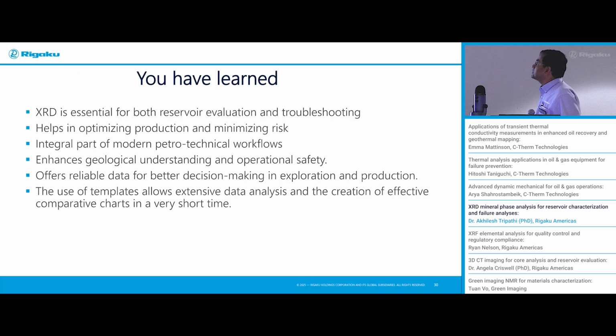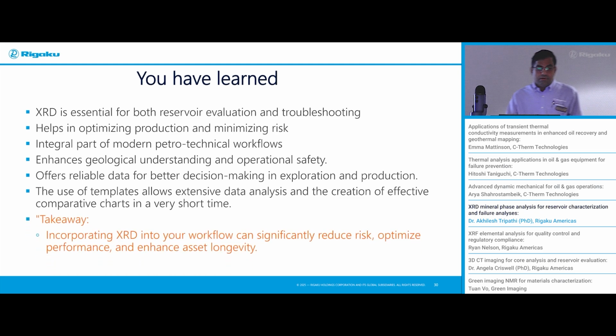So I believe with this presentation, you learned XRD is essential for both reservoir evaluation and troubleshooting, helps in optimizing production and minimizing risks. It could be an integral part of modern petrotechnical workflows. It enhances geological understanding and operational safety, offers reliable data for better decision-making in exploration and production. The use of templates allows extensive data analysis and the creation of effective comparative charts in a very short time. Takeaway: incorporating XRD into your workflow can significantly reduce risk, optimize performance, and enhance asset longevity.